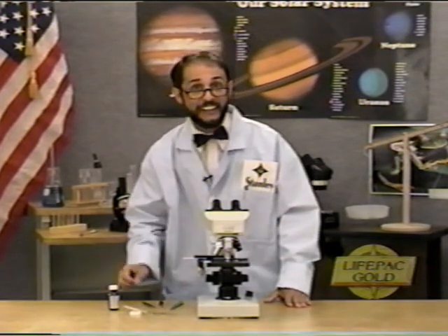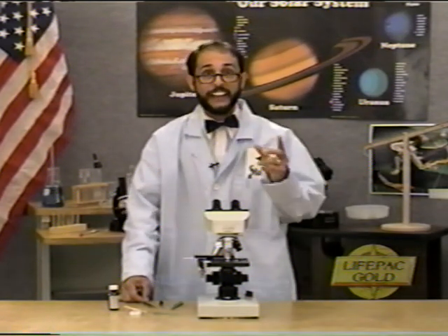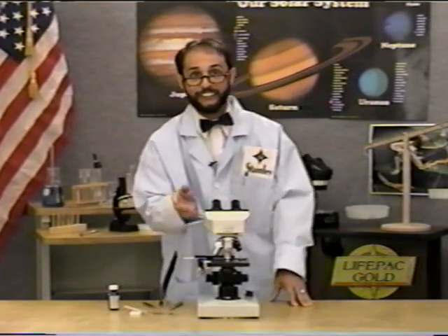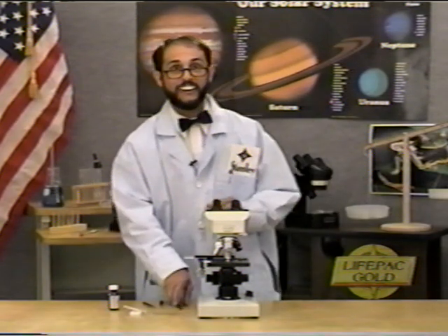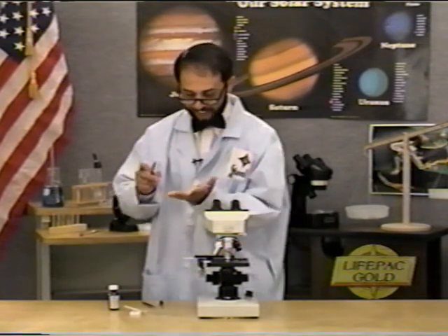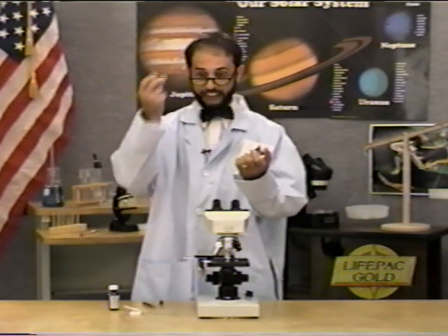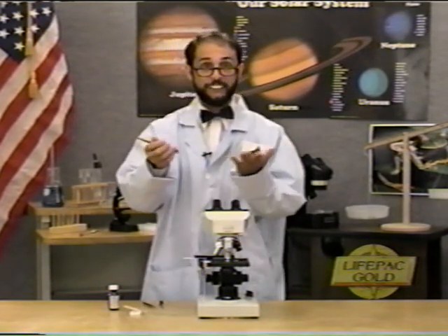In order to see them, we need a microscope. A microscope magnifies things so that we can see it very clearly. Here's my microscope, so I guess we're ready to see. We'll need to make a slide of some human cells here. So to find some interesting samples of human cells from our body, we can look at our hair or eyelashes or fingernails or any number of things.